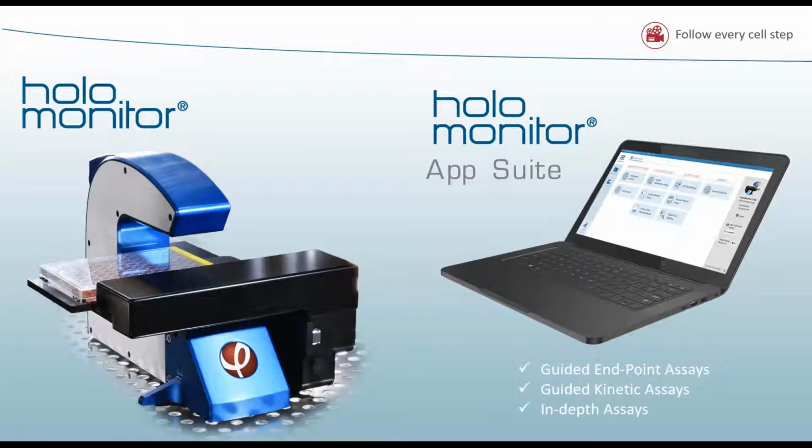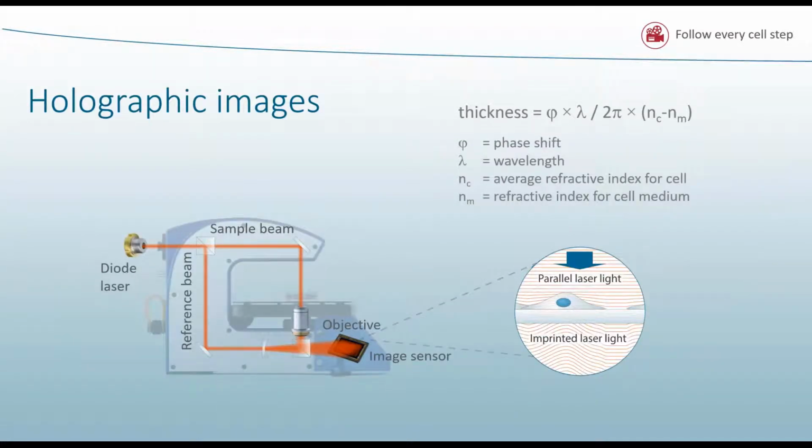Okay, so how does this work, this fantastic instrument? I'm trying to just shortly explain how the holography works to make sense of what I'm showing you later. So to the left here, you can see that there is a diode laser. The laser beam will be split into 2 beams, where the sample beam will pass through the cell sample. It will go through the objective, and there it will meet the reference beam.